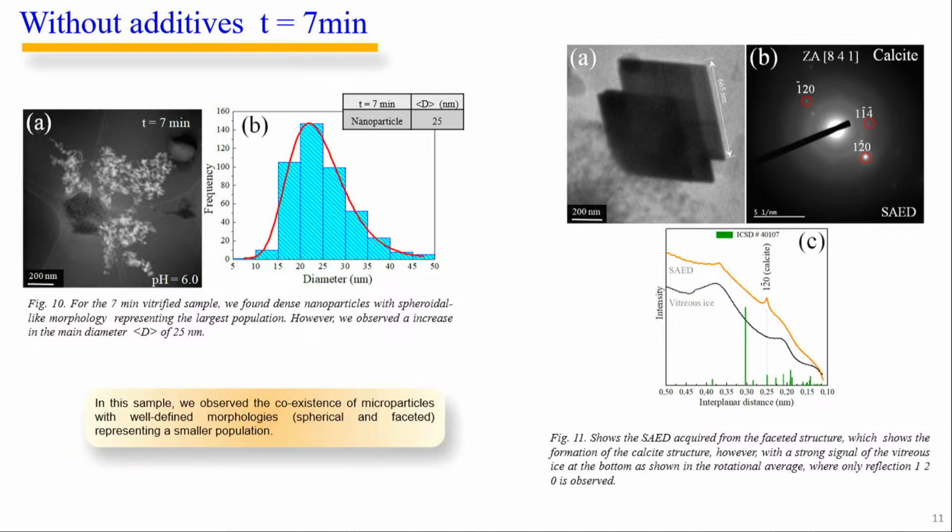Without additive, at sample time 7 minutes, we form dense nanoparticles with spheroidal morphology.